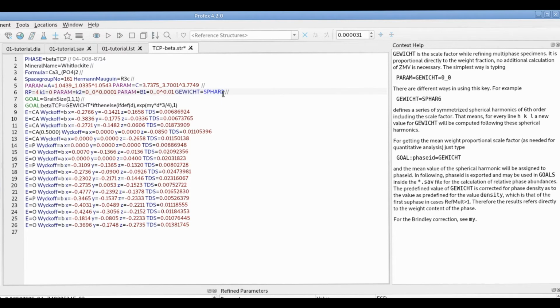So this is still a relatively simple function. It allows one direction of preferred orientation. It might work for maybe for very strongly orienting samples like clay minerals or gypsum or anything with platelets. But sometimes this is not enough to describe the orientation pattern at the surface of the sample. So we need a higher polynomial or spherical harmonics function.